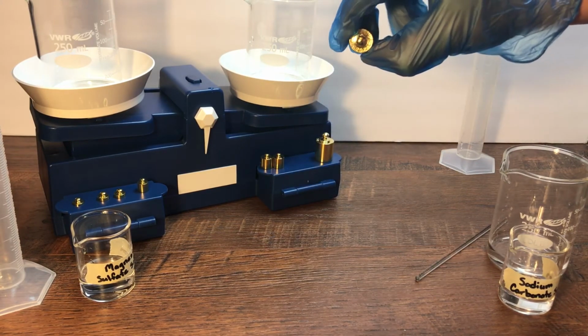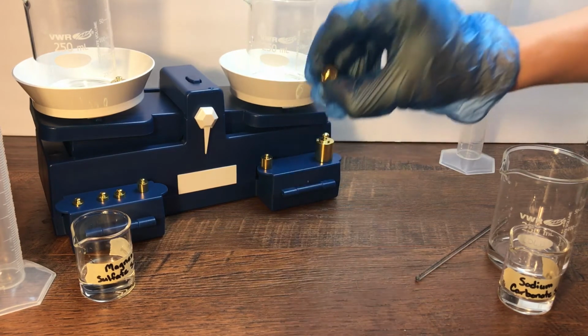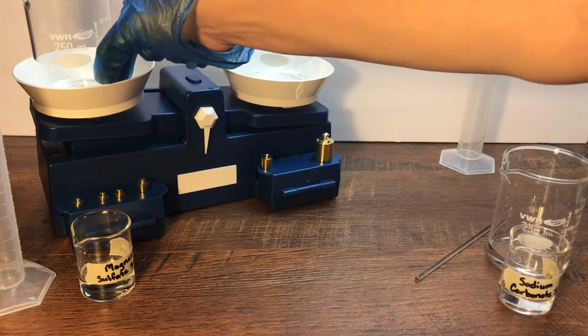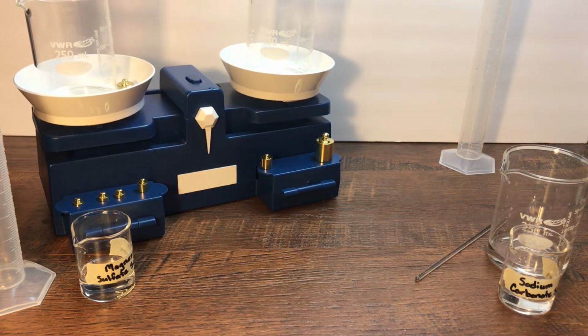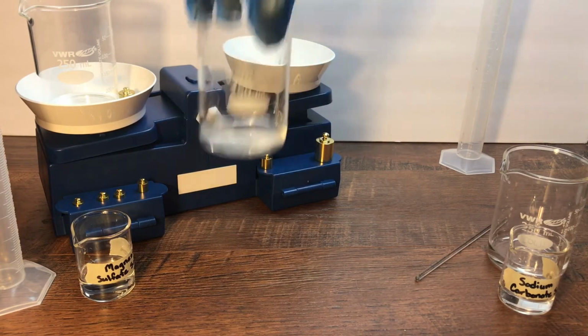Again, let's start with our 20-gram weight. I'm going to add a 10-gram. There we go. Looks like we've got 30 grams of magnesium sulfate solution as well.